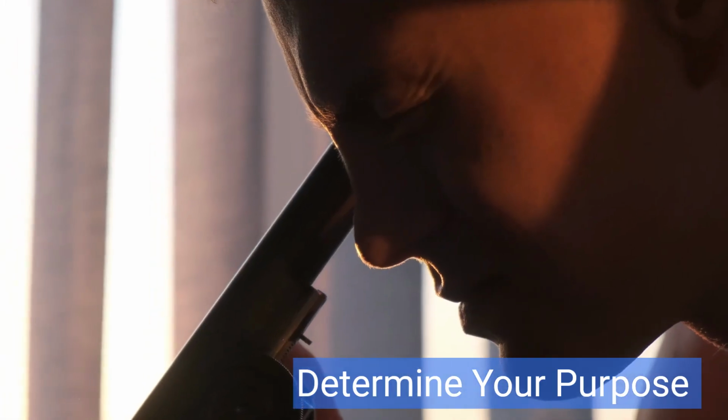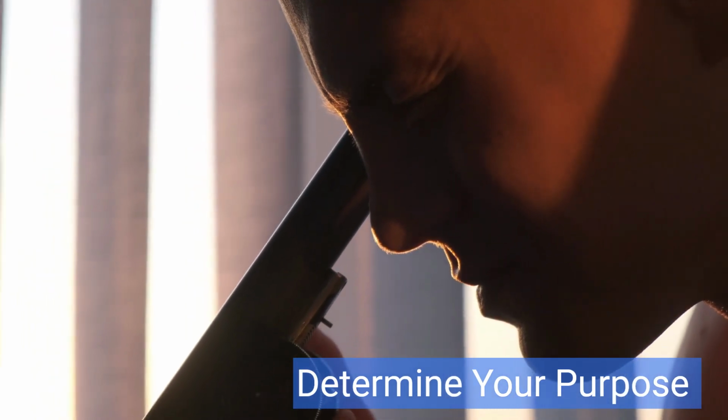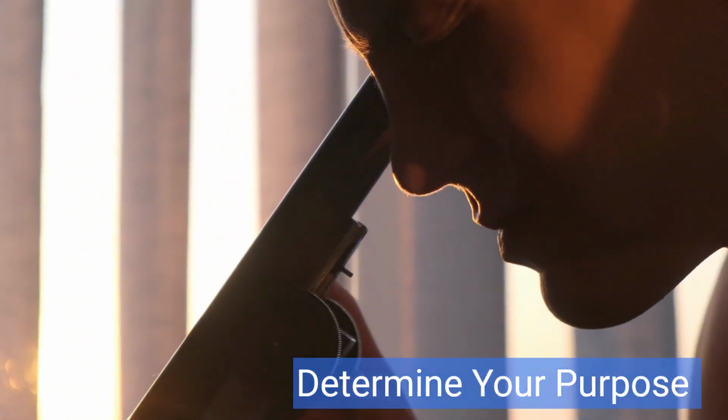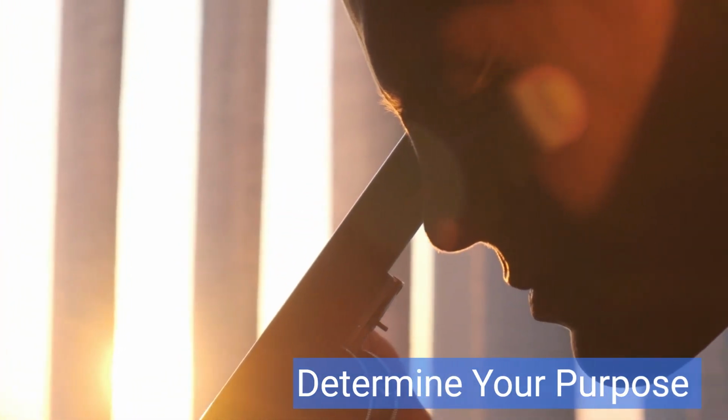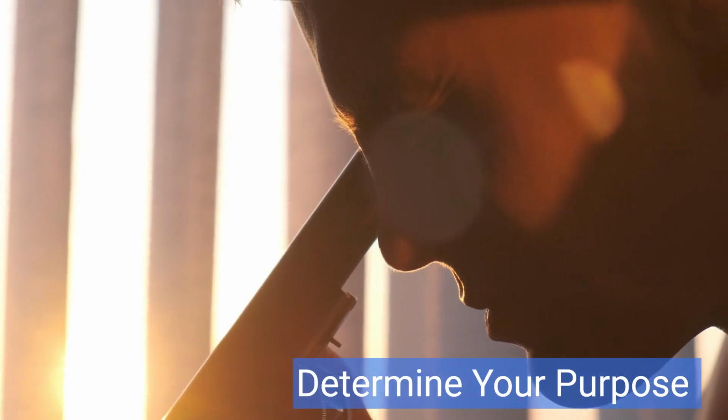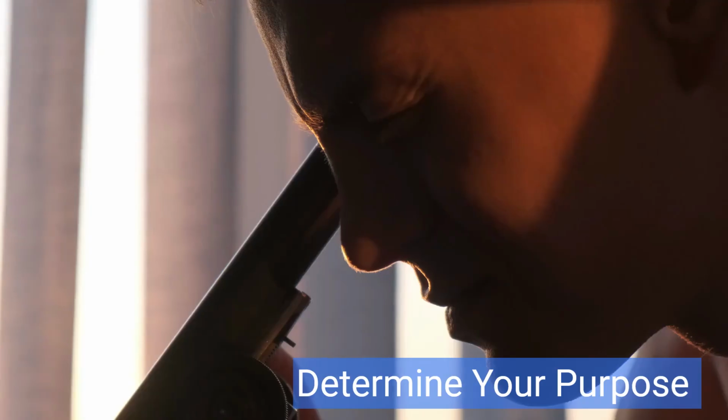Step 1. Determine your purpose. Consider why you need a microscope. Are you studying biology, chemistry, geology, or a specific field? Different microscopes are designed for different applications.